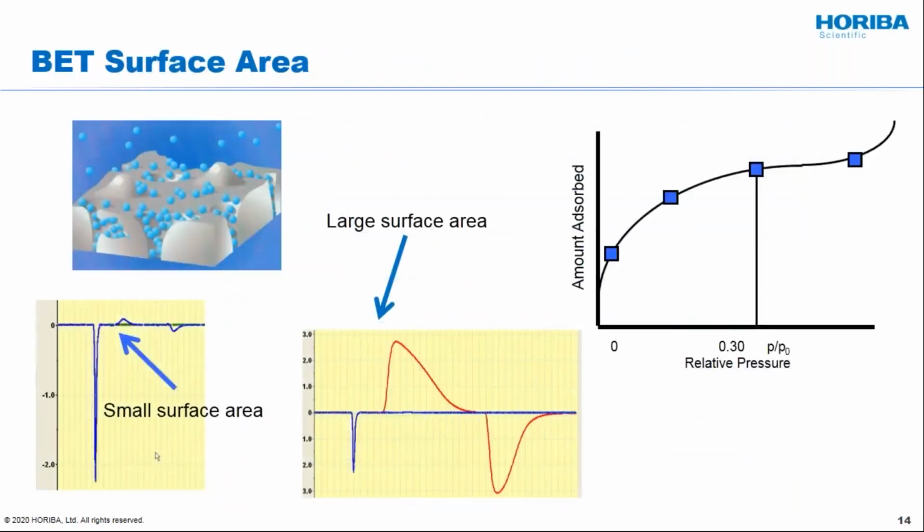Now, the one other topic we're going to talk a little bit about is no longer particle size, but particle characterization. Here you can see the BET surface area. And I think what you're going to find is very, very often this technology goes hand in hand with your particle characterization, because what you're looking at here is the hand-in-hand partner with this particle size measurement.